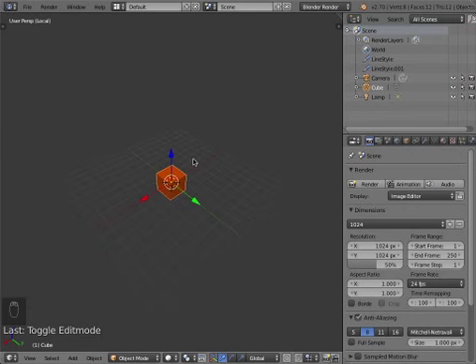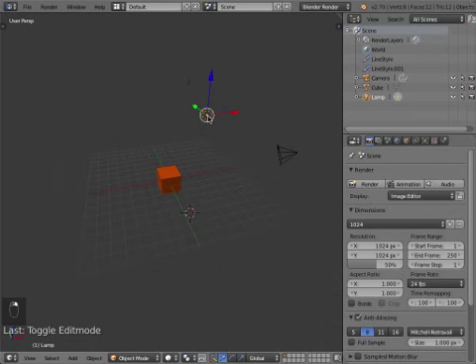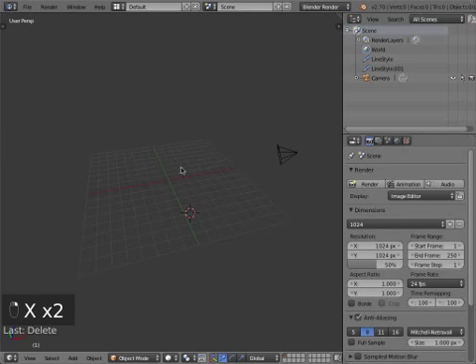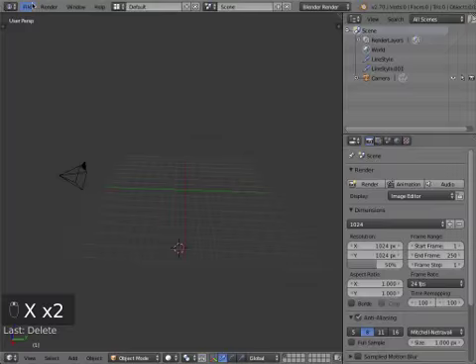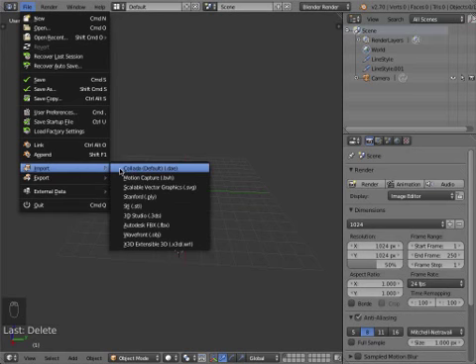So let's get cracking with some atom probe data. Get out of the local view. We're going to work without lighting in this case, and we're going to get rid of the cube because that's not actually atom probe data. I'm going to show you later how to create the OBJs, but since we're now in the workflow with Blender already, we'll just load in some data. If you go to File, Import, you'll see the different file formats you can import. There are other plugins as well, but mostly these are the important ones.